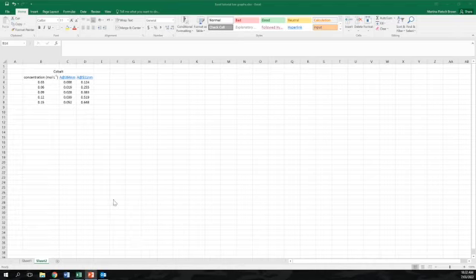We are working with data from the chemistry lab where we have measured the absorbance values for different cobalt solutions. With these values, we are trying to create a calibration curve, which is a plot of absorbance over concentration.